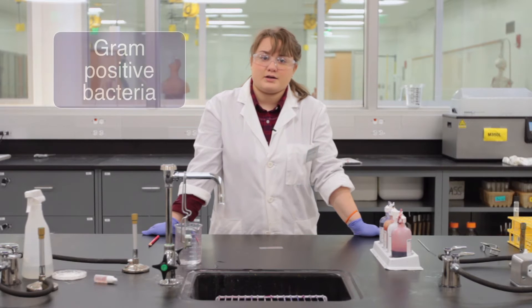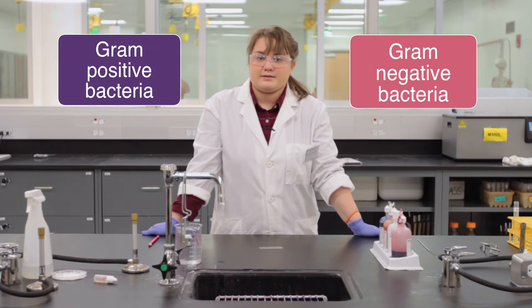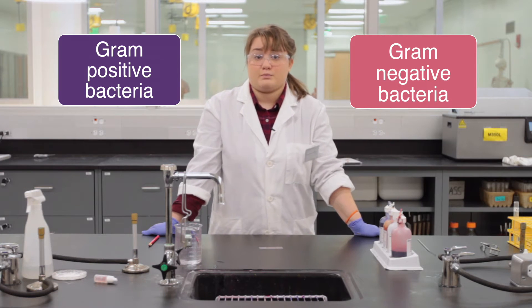Gram-positive bacteria have a thick peptidoglycan layer and they should stain purple, and gram-negative bacteria have an outer membrane and a thin peptidoglycan layer and they will stain pink.